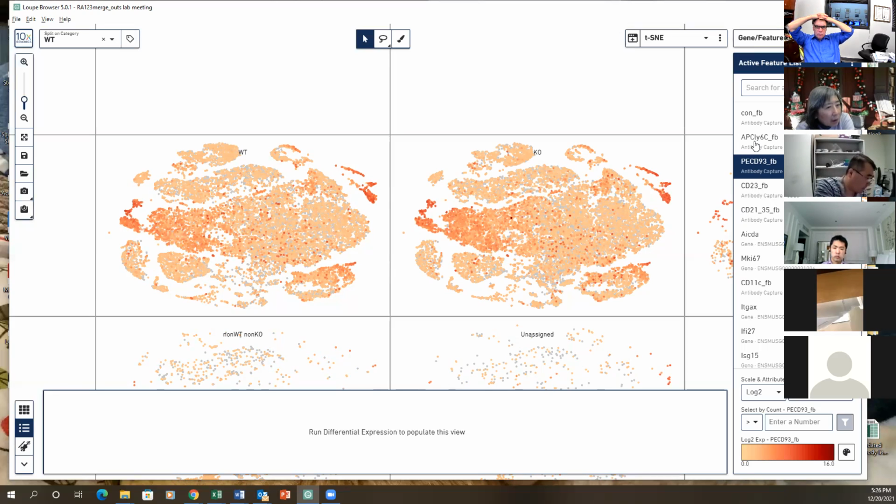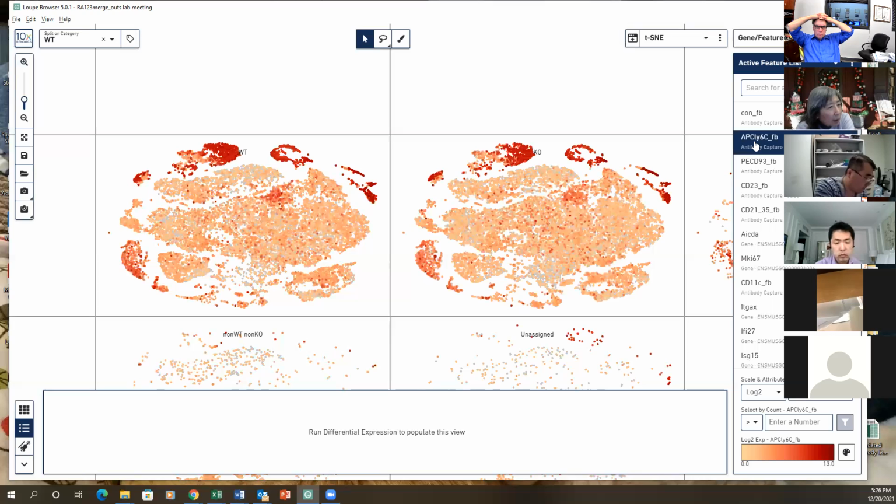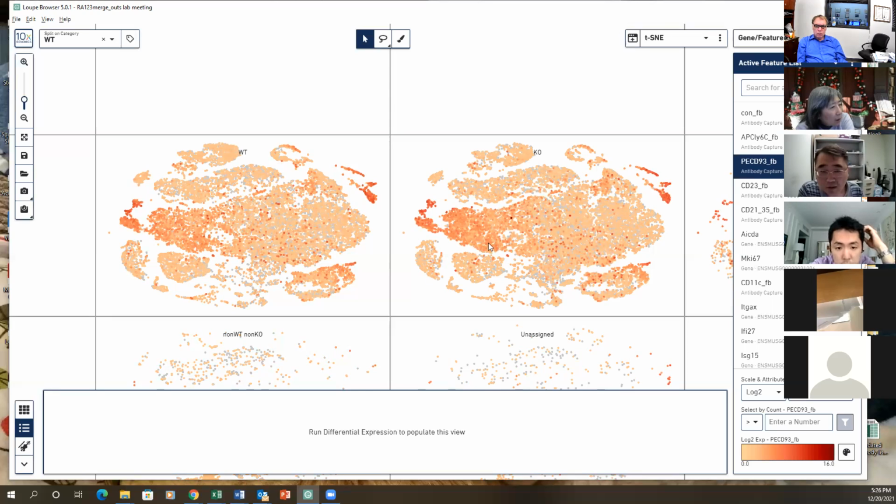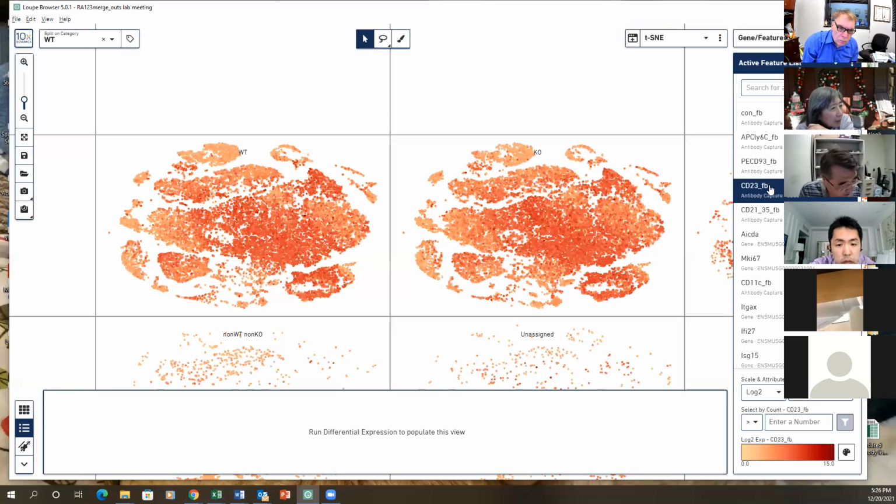And okay, LY6C, that's probably plasma or memory. Memory and plasma, I think. And this is 93, so transitional on this end. So maybe bigger in the IL-17 receptor knockout. And 23, similar.